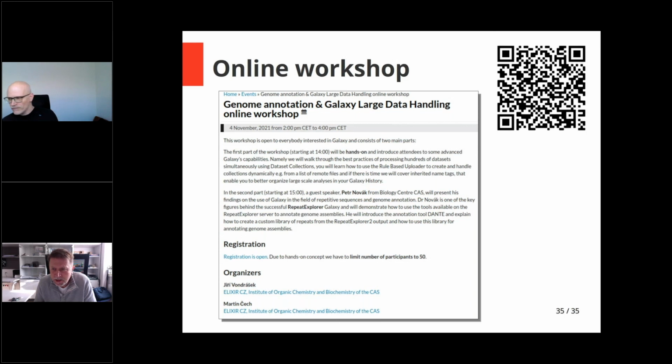Akara is asking, how do you define lineages, phylogenetically or by some specific mutations? Yeah, well, these are defined phylogenetically as a clade on the tree. There are still tendencies to define the families by, for example, an old definition: a sequence which has at least 80% identity over 80% of the length of the element over at least 80 base pairs. But this definition doesn't always work, and I think it doesn't really have a good foundation in phylogenetics. So we use a phylogenetic definition.